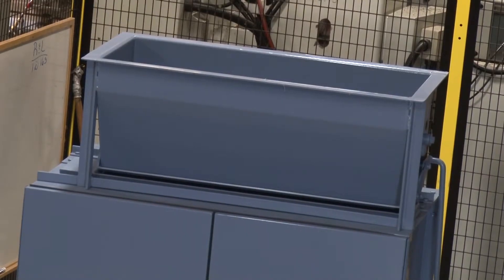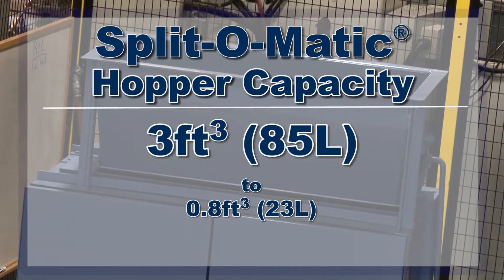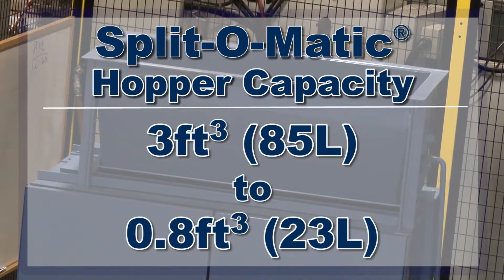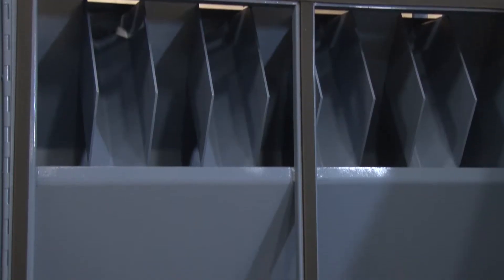Split-O-Matic splitter models have a hopper capacity range from three cubic feet to 0.8 cubic feet. These integrated hoppers with their hopper gate release mechanism allow for proper loading of the bulk sample to ensure even material flow through the chutes.